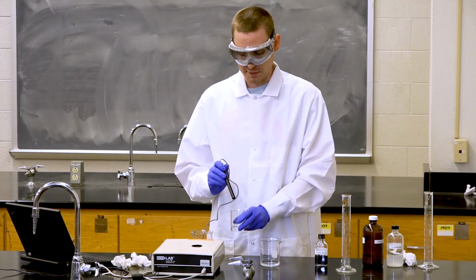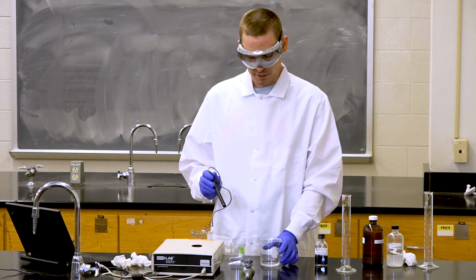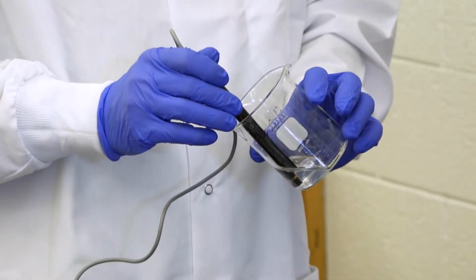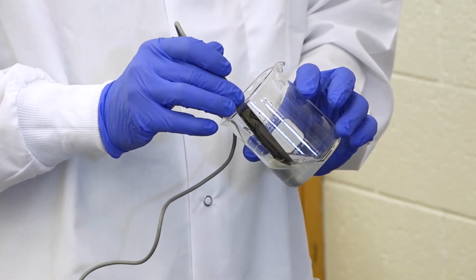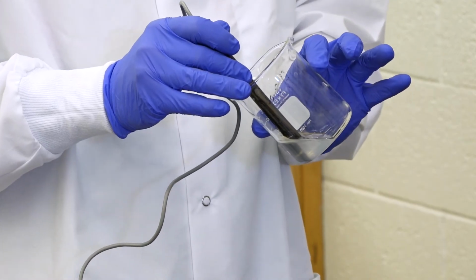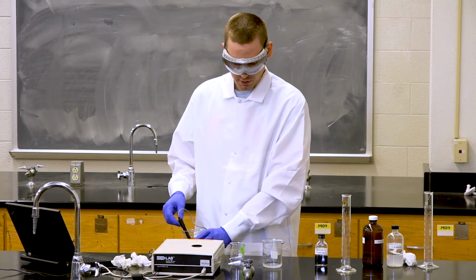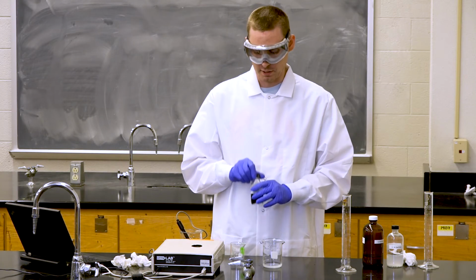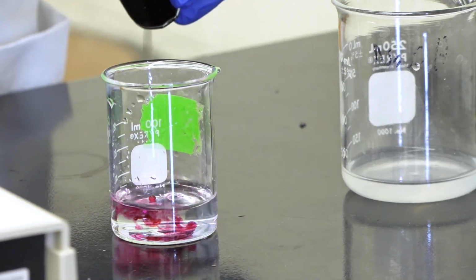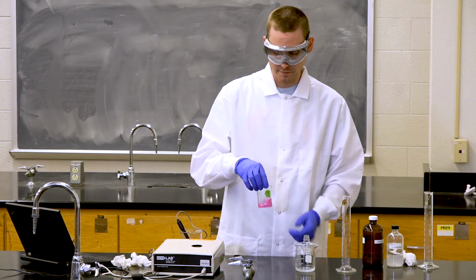We can then measure the conductivity of each of these solutions by themselves and record the readings that we get. The conductivity will be significantly higher for the acid than it was for hydrochloric acid because we didn't dilute it, and similarly for our barium hydroxide as compared to our sodium hydroxide because once again we didn't dilute these. So after we have measured the conductivity of those two solutions, we can add a couple drops of our thymol blue indicator to the sulfuric acid, which will indicate that our sulfuric acid is indeed an acid by turning red.